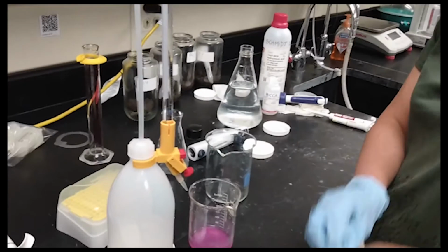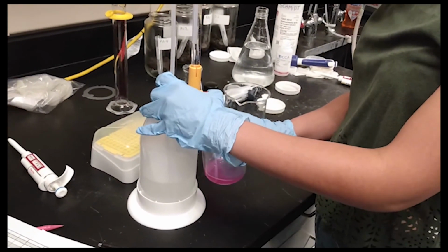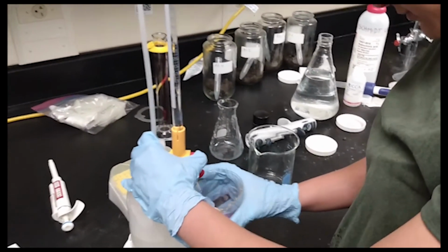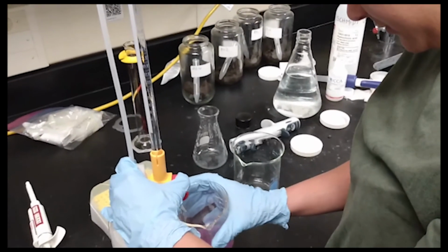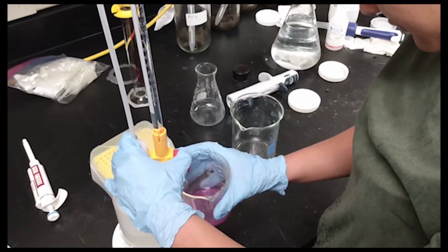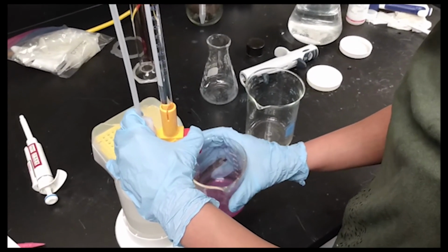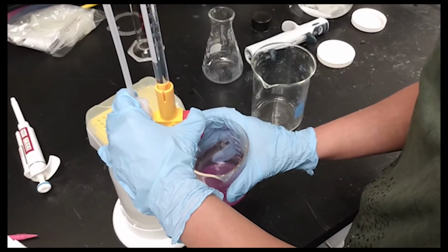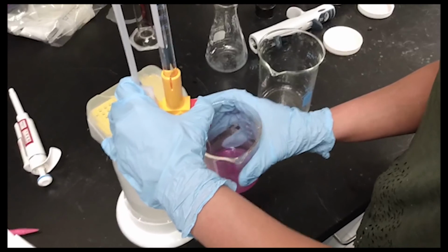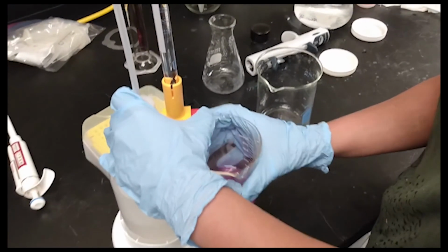And any less than that, and we know that some of the sodium hydroxide was transformed. To do a titration, we want to very slowly measure out how much acid is required, and we want to be very exact. So we will put in perhaps 1 drop of acid at a time to try and measure small volumetric differences in the amount of acid required to neutralize our solutions. So this is a process called titration.